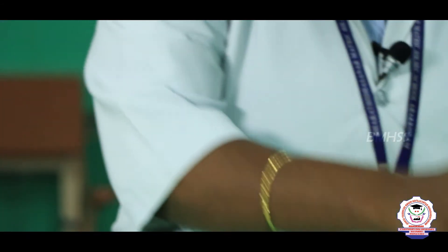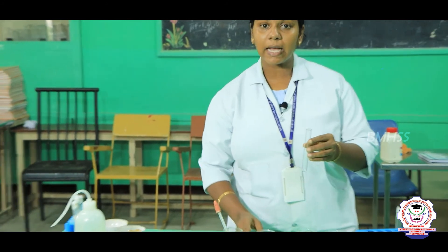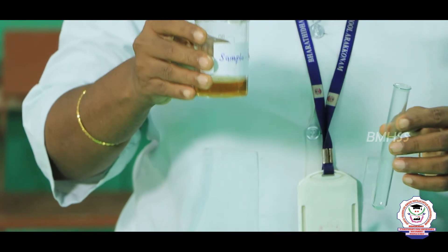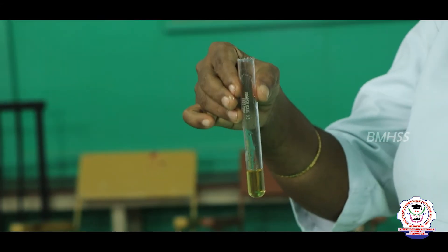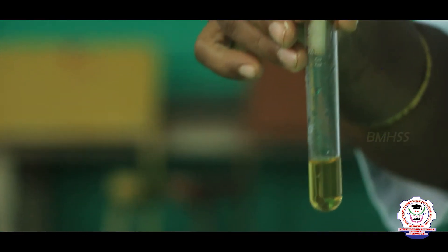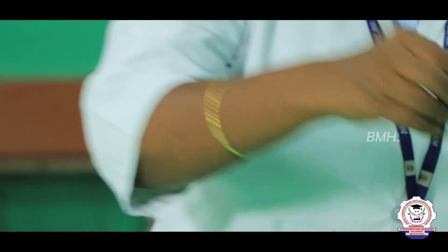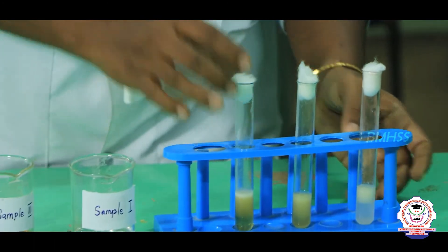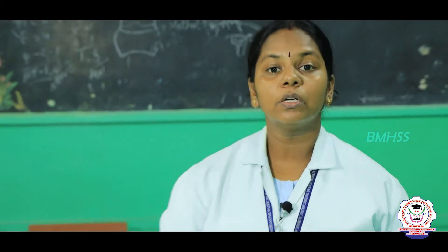This test tube contains sample 2. Next we repeat the experiment with sample 3, which contains jaggery and salt. We add 2 ml of sample 3 to a test tube, add the yeast solution, and cover it with a cotton plug. Now we are going to wait for a while and notice the time taken in each test tube for fermentation. We can observe fermentation by the effervescence — white foam formed inside the test tubes indicates that fermentation is taking place.